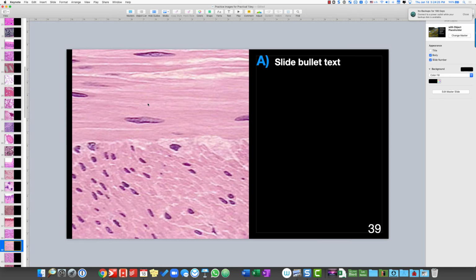So in many places, like your digestive tract, you have two layers of smooth muscle. So when you cut the wall of the digestive tract, you're going to get this effect. One layer of smooth muscle running in this direction, another running in and out of the plane. Okay. Spindle shape. They are not striated, unlike skeletal muscle and cardiac muscle.